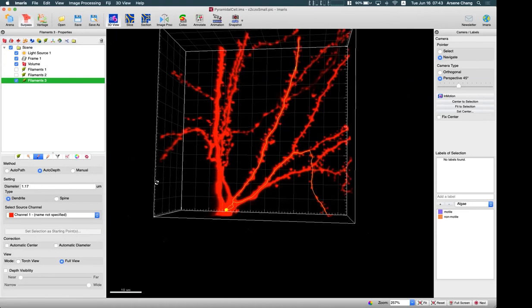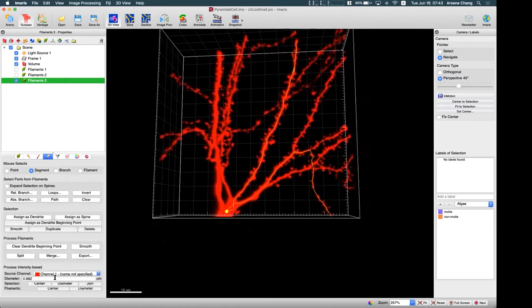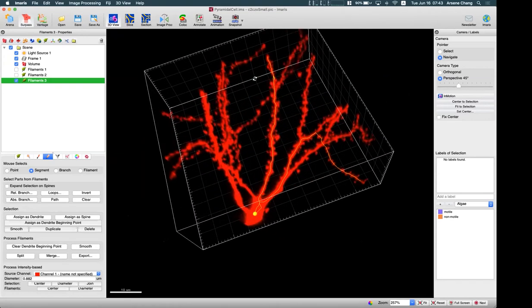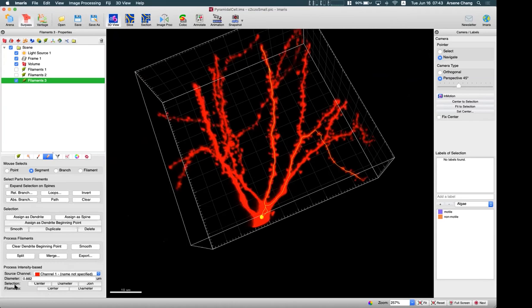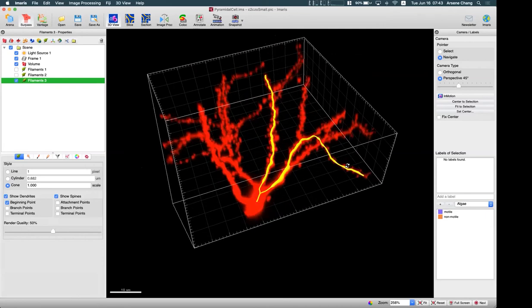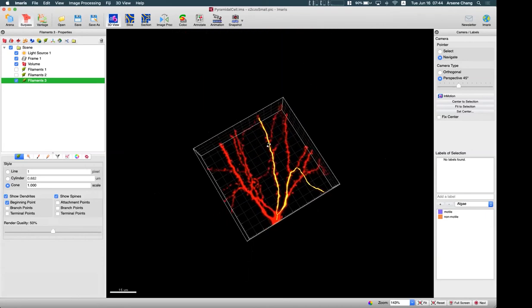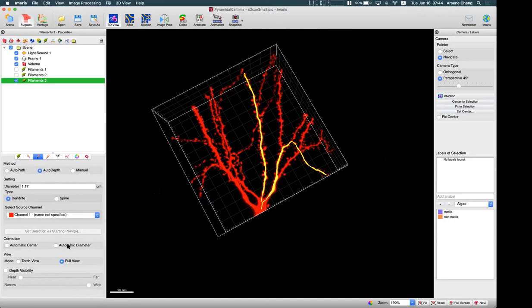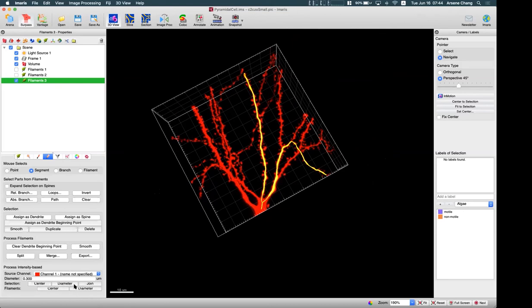After using auto path, the results will likely be better using these functions, though you may see some ups and downs along the Z-axis due to intensity distribution. For whole filaments you can do a recenter, and if you care about the diameter you can redo it. These results are not too bad. These are the different ways you can use Imaris auto path or auto depth to semi-automatically trace different samples. When doing auto path or auto depth, you can already apply automatic center and automatic diameter, so you probably don't need to go back and redo it — but you have the option to apply corrections as needed.